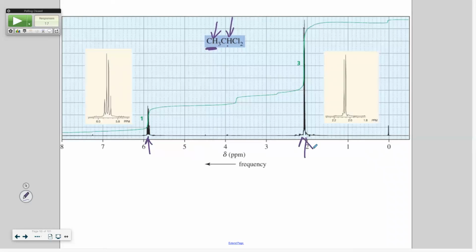We don't get nice, pretty singlets like I've been purposely showing you in the other section. Do you see that there are 2 there? Sometimes that's hard to see, so what they'll do is a blow up, and we can do this on IR and NMR, believe it or not. This is a blow up of this peak right here. Is it easier to see the doublet there?